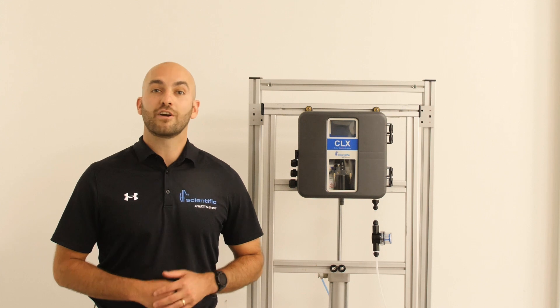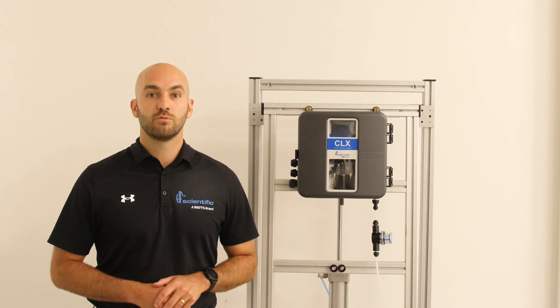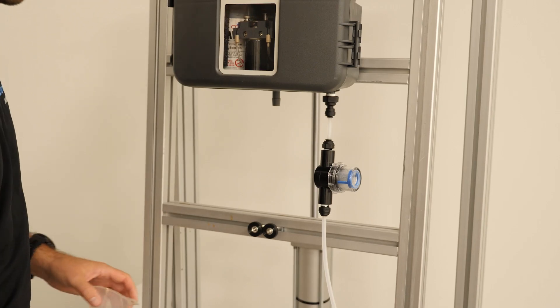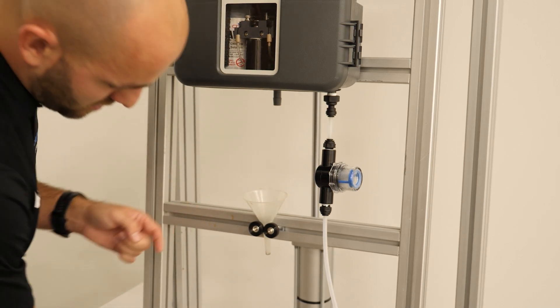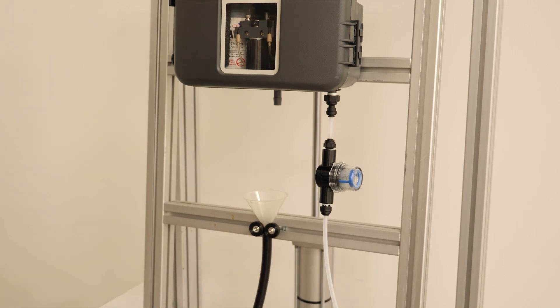Next, we will install our air gap drain. This is a very important step in the setup procedure. Air gapping the drain will allow us to have proper draining on the analyzer. I like to use a plastic funnel, but you can use PVC if you prefer. The key is to make sure nothing is touching the drain fitting and there is space to let the water freely flow out of the bottom of the analyzer.